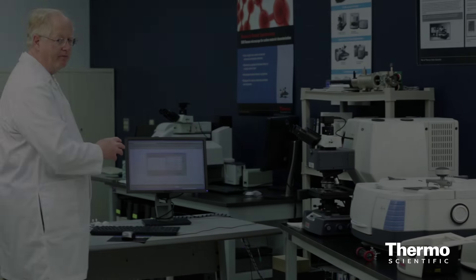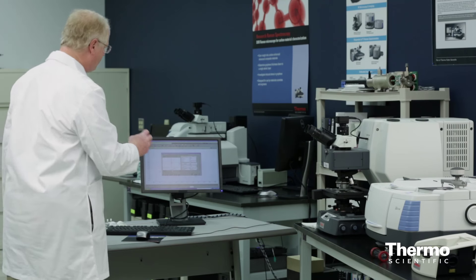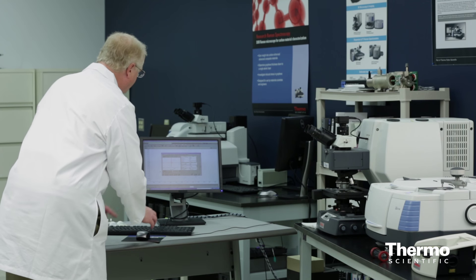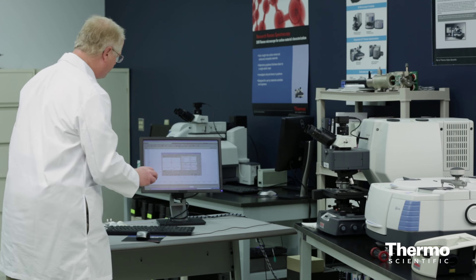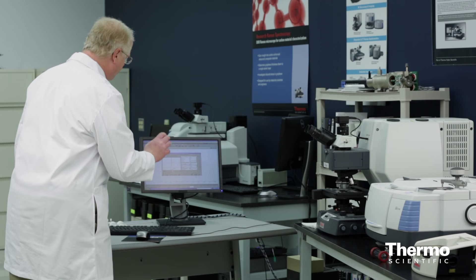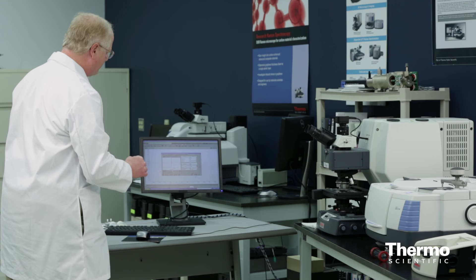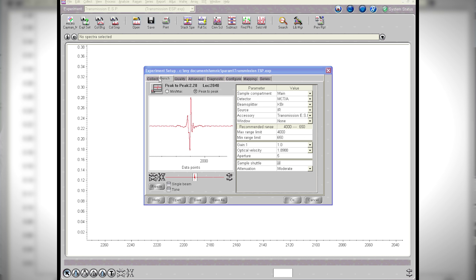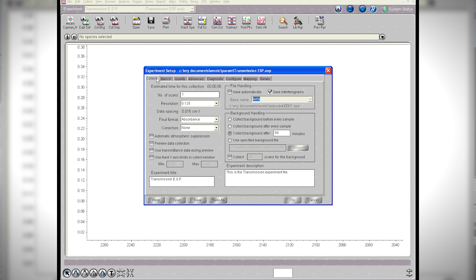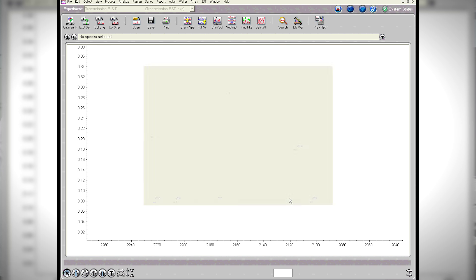This experiment is set up for high resolution spectroscopy. I'm using the MCT detector, which is the high speed detector. I've got it set with a very small aperture because I'm running at high resolution — 0.125, which gives me about a 0.08 wavenumber resolution. So now let's go ahead and run this.